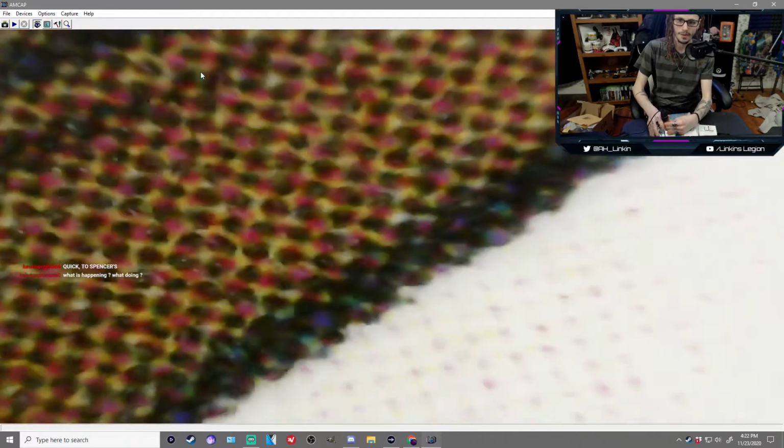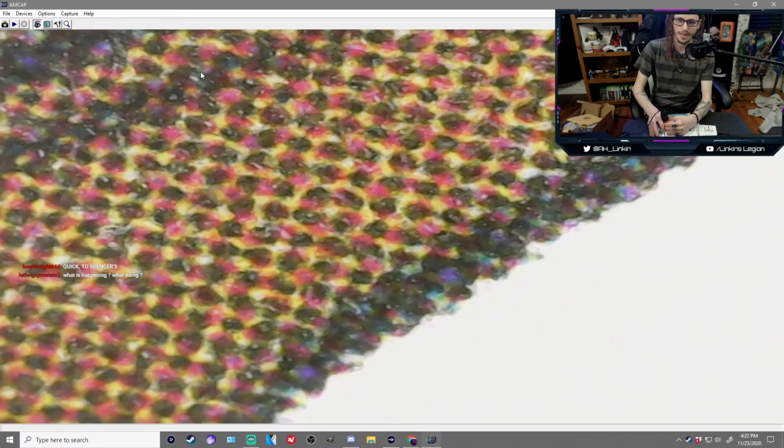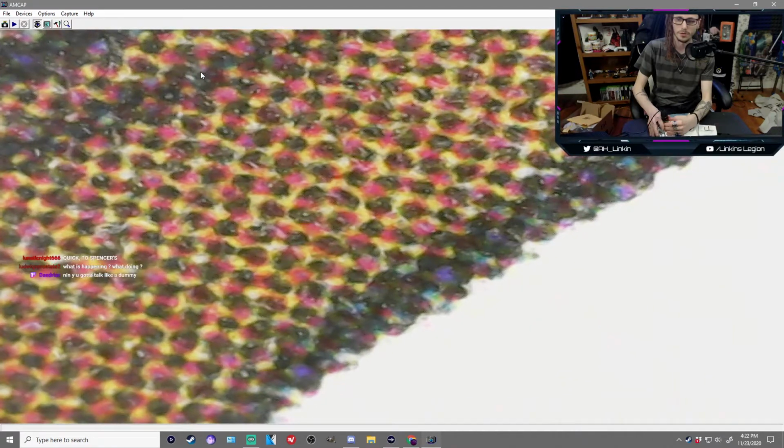That is solid brown of hair. But then when we zoom in, you can see that's what's making up the brown. That's what's giving the illusion of brown.